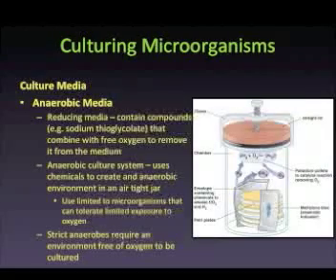A palladium catalyst then reacts with hydrogen and oxygen to form water. A paper strip impregnated with methylene blue is placed in the jar as a visual indicator. The blue color of the dye is only visible when oxygen is present to oxidize the dye.